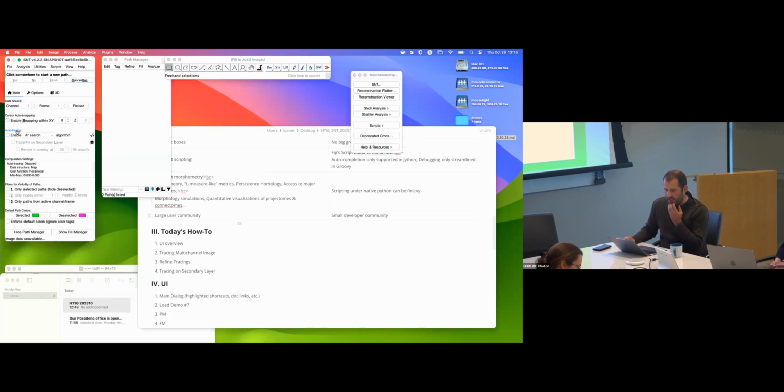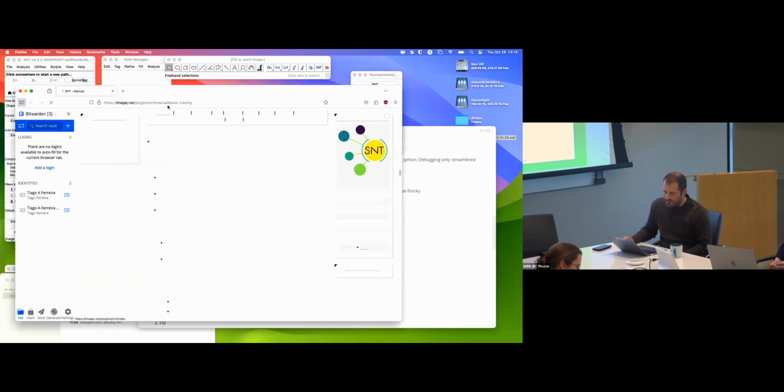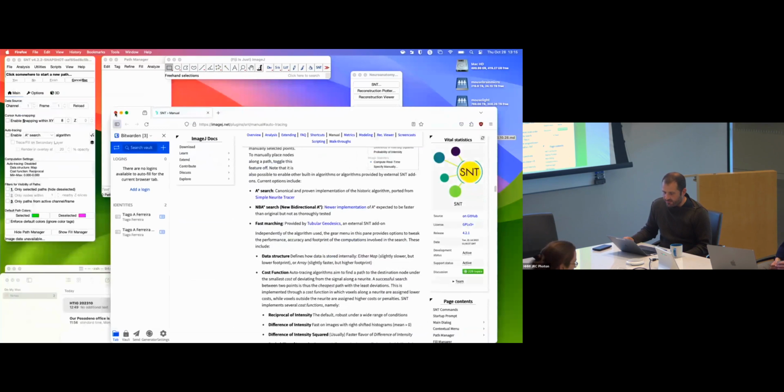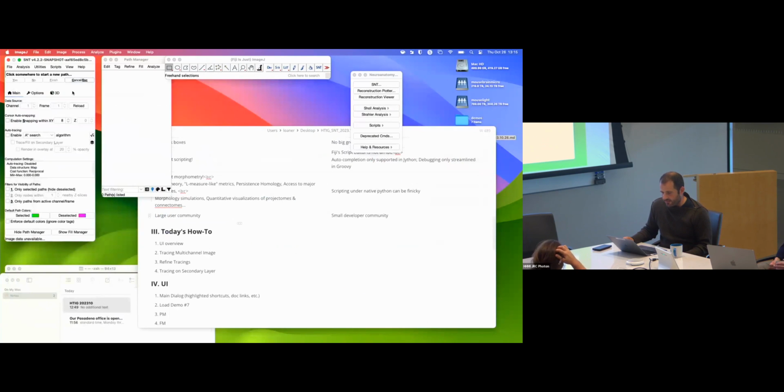The sections are divided by headers, and if you click these, you go to the manual. I know these are minor details, but it just makes things accessible.